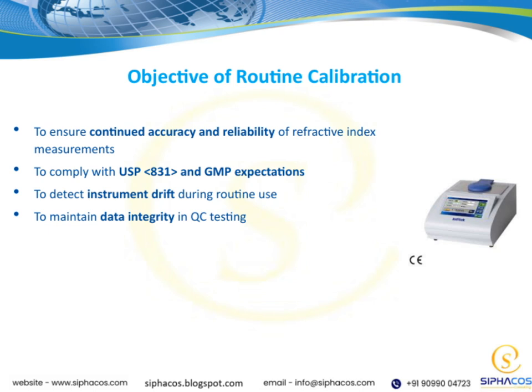Another key point is the ability to detect instrument drift during routine use. Instruments can drift or go out of calibration without us noticing immediately, so regular checks help catch any deviations early before they affect our results.